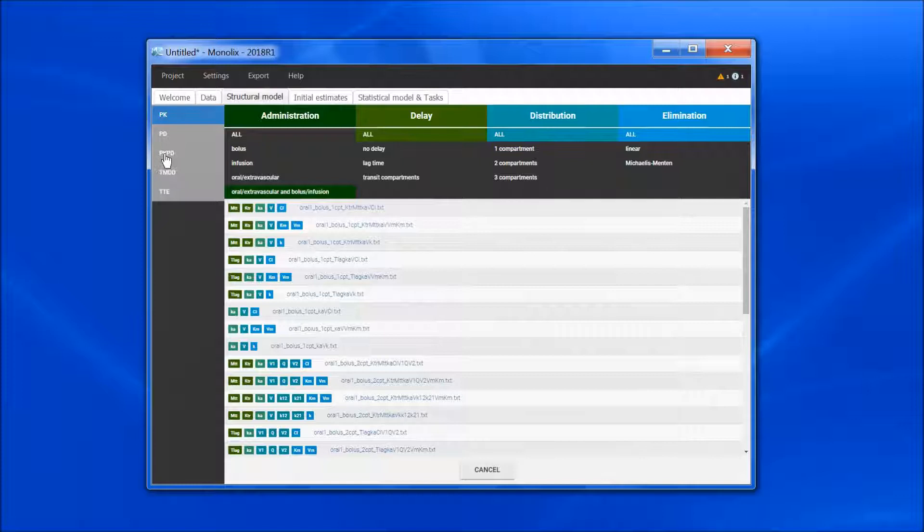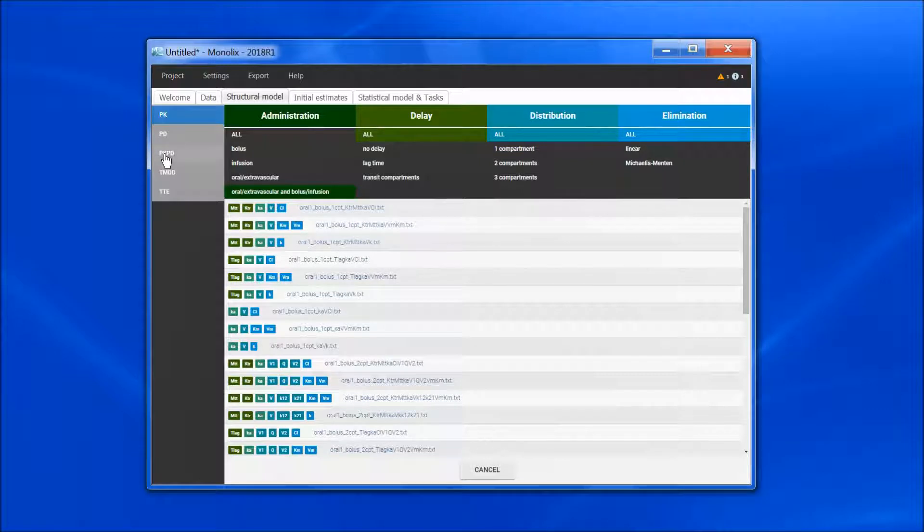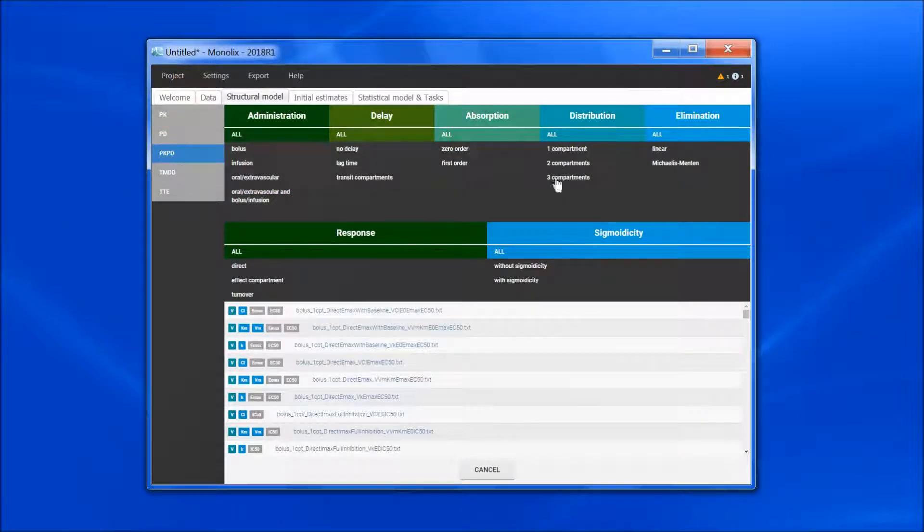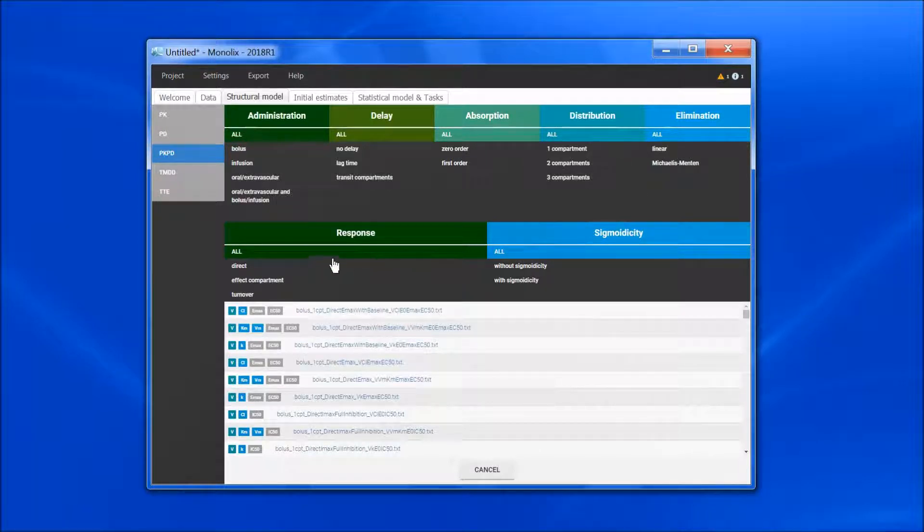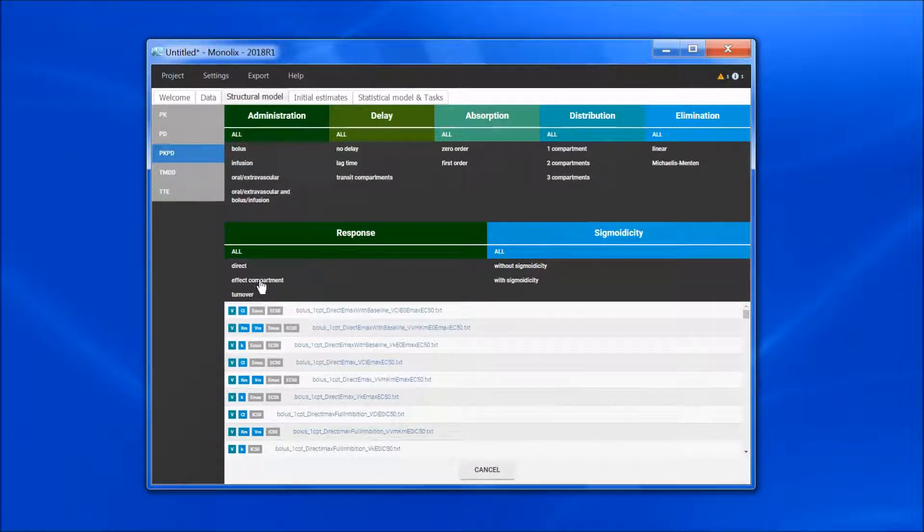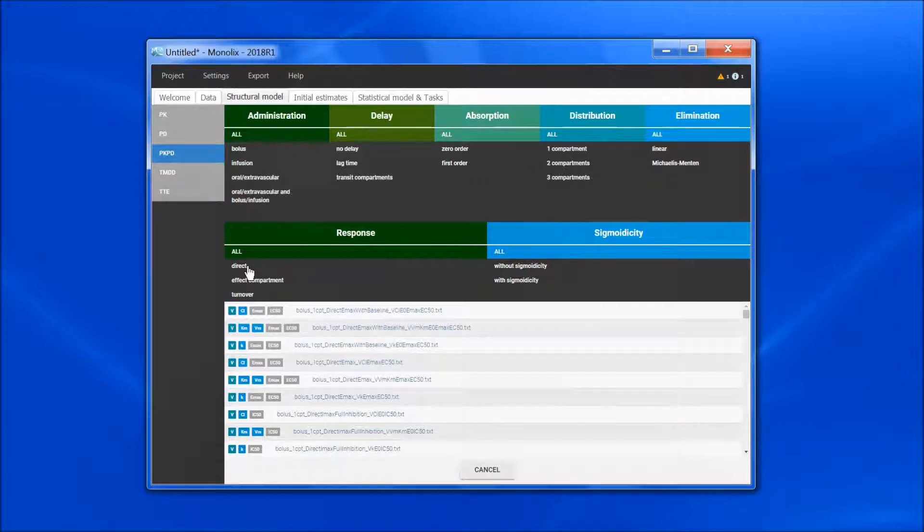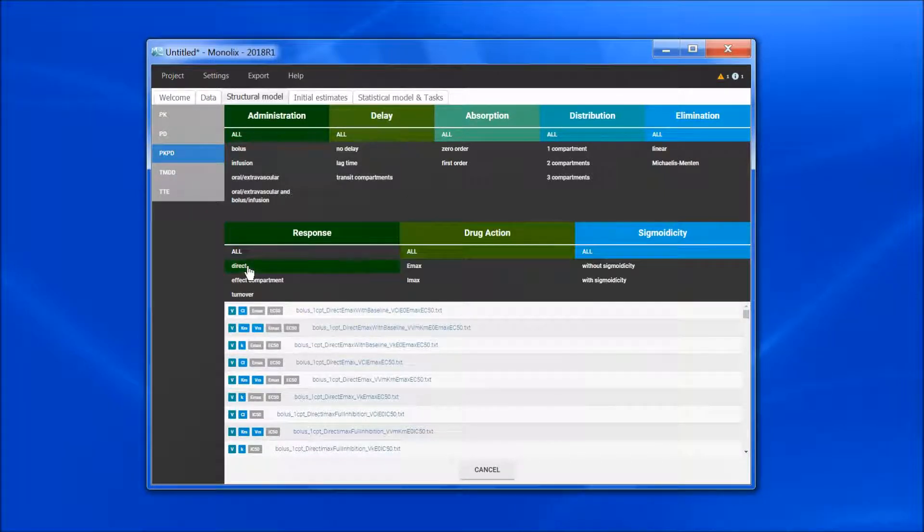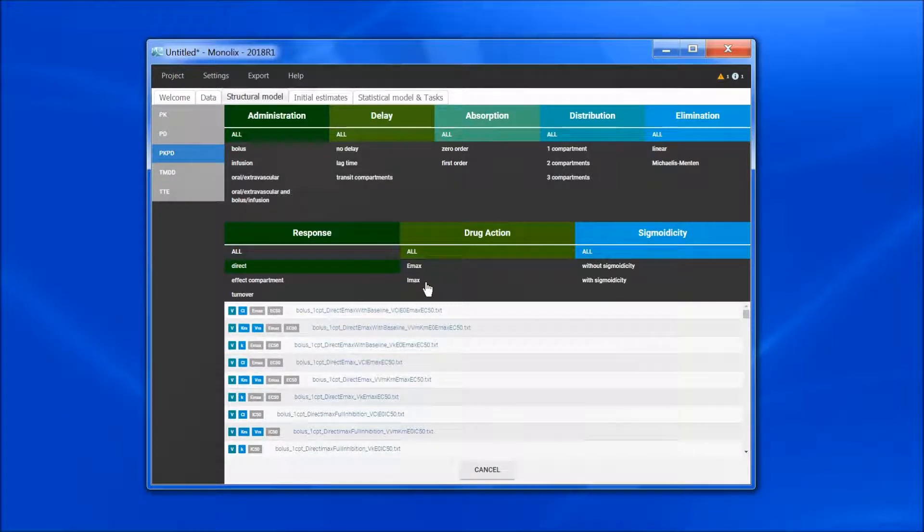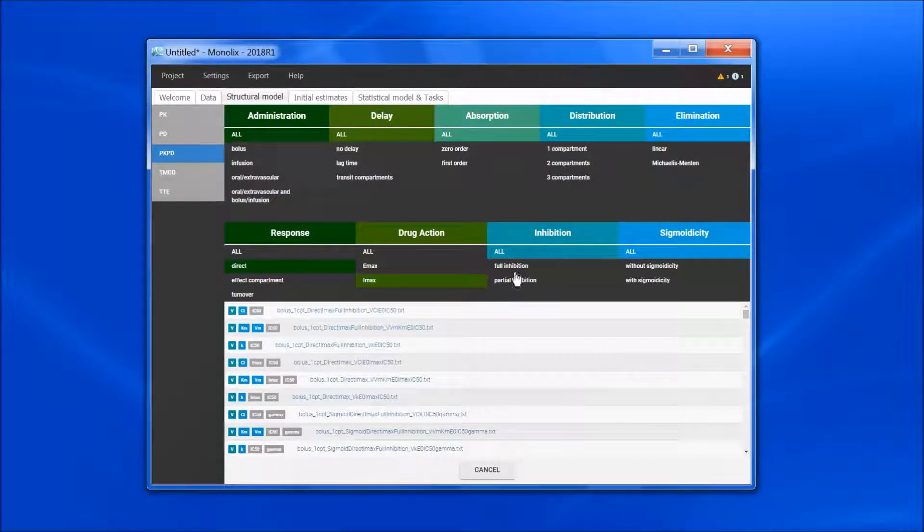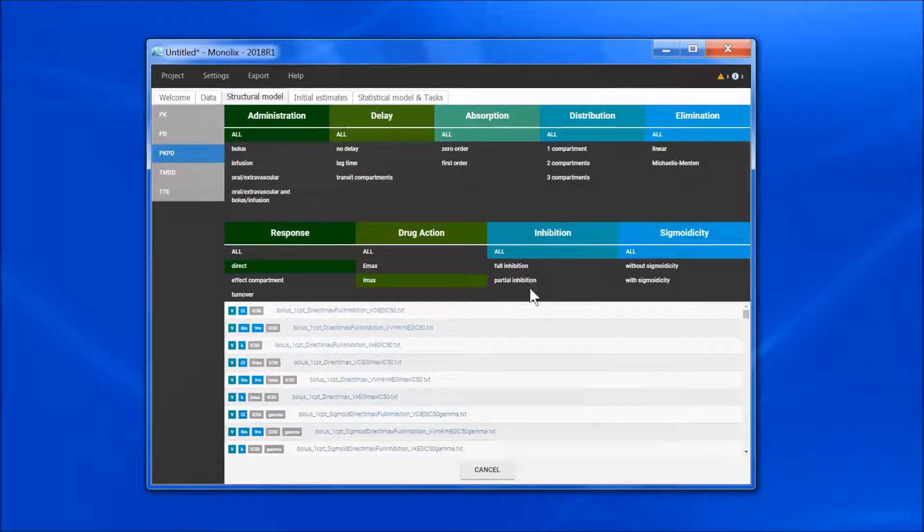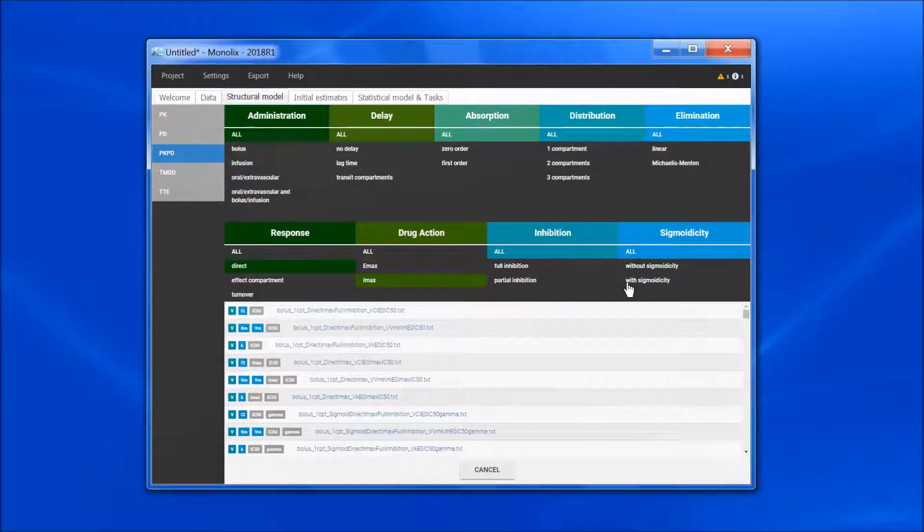For the PK-PD library, I have the same options as in the PK library, plus the PD part. I can choose a turnover, effect compartment, or direct model with Emax or Imax drug action. For Imax, I would also be able to choose between full or partial inhibition, and with or without sigmoidicity.